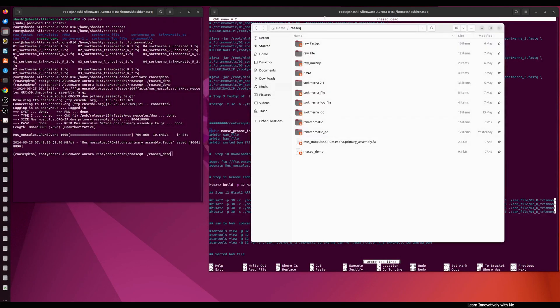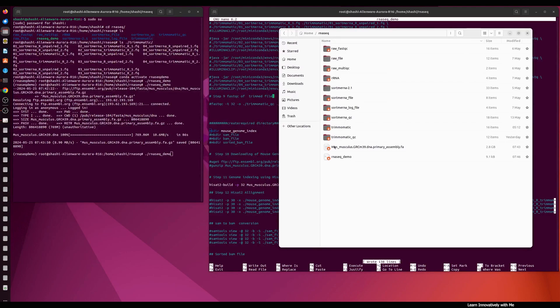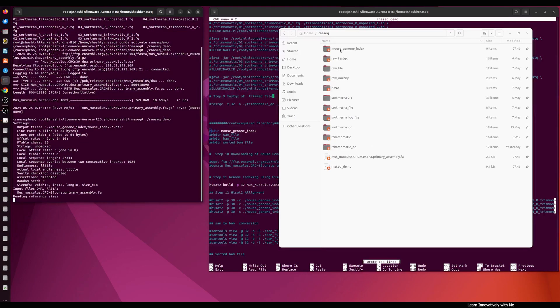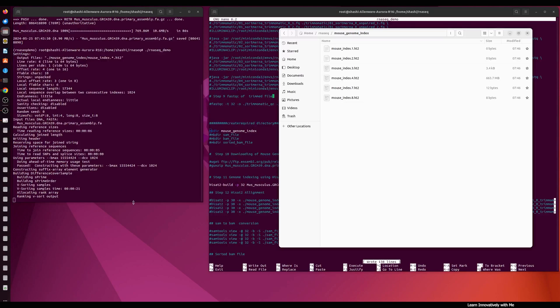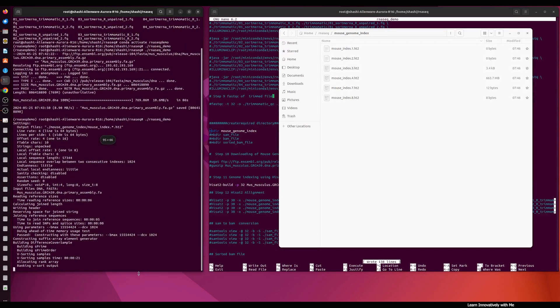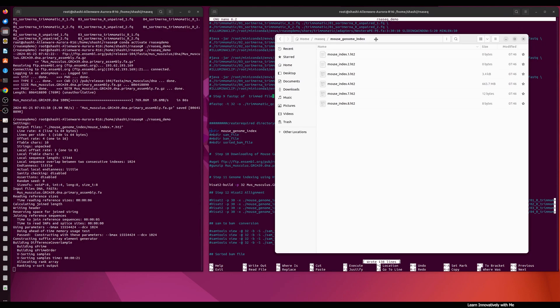I'm going to save the script and run it. You can see in the RNAseq directory there was no mouse genome index directory before, but after running the script the directory is created. If you open it you can see the mouse index files are being generated, but we have to wait for the script to finish the complete index file.